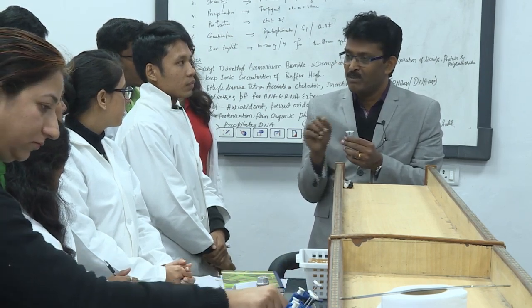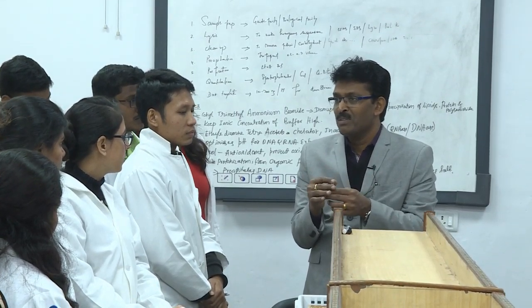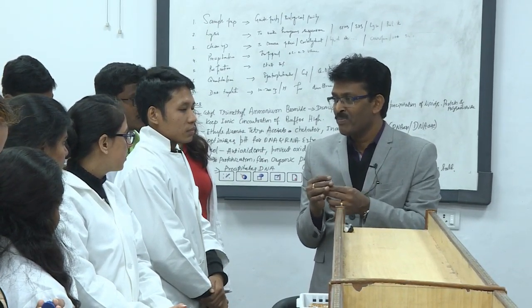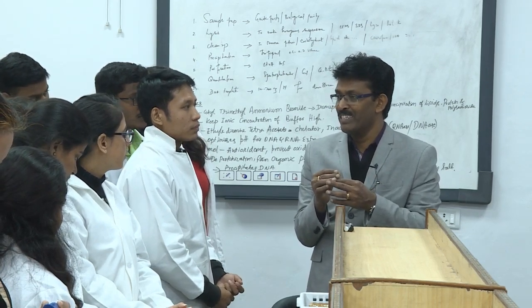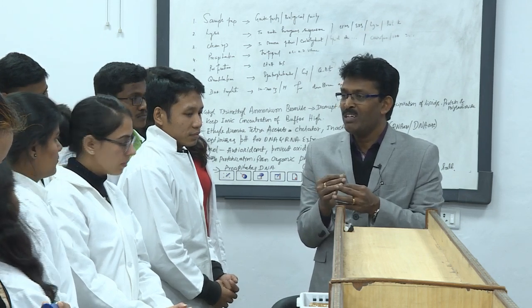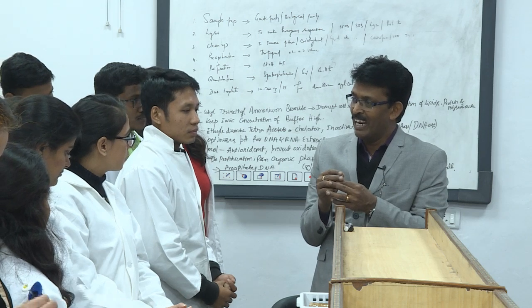Then you can put one hyphen, then the place you collected the sample, let us say it is from Delhi, or if it is from Almora, then you evolve some coding system so that you don't forget it, right? So R, B, 1, hyphen, then put Almora, ALM.